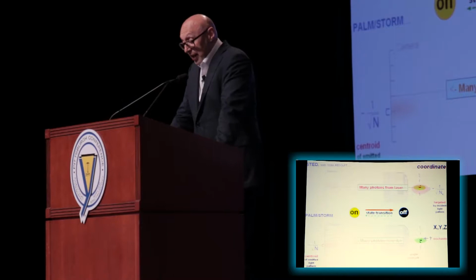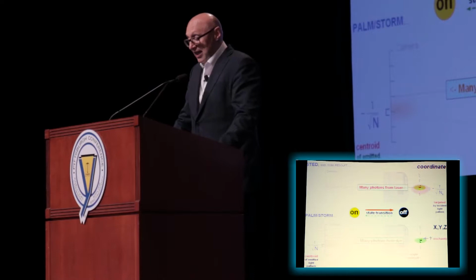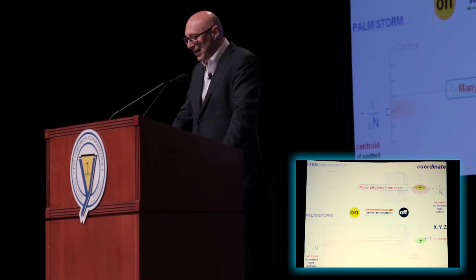Well, a clear strength of the PALM/STORM concept, if you want to get down to a high spatial resolution, as I said, down to a nanometer or so, is the fact that you work with single molecules. Because if you want to have molecular resolution in the end, it's always an advantage to already work with single molecules, because you're dealing already with these small entities.